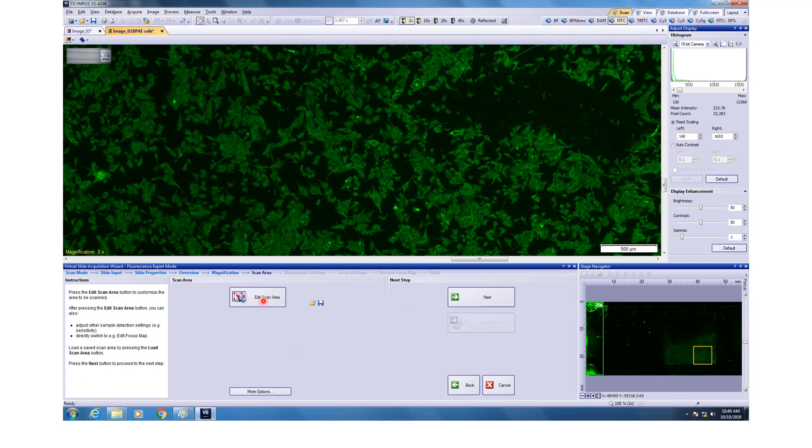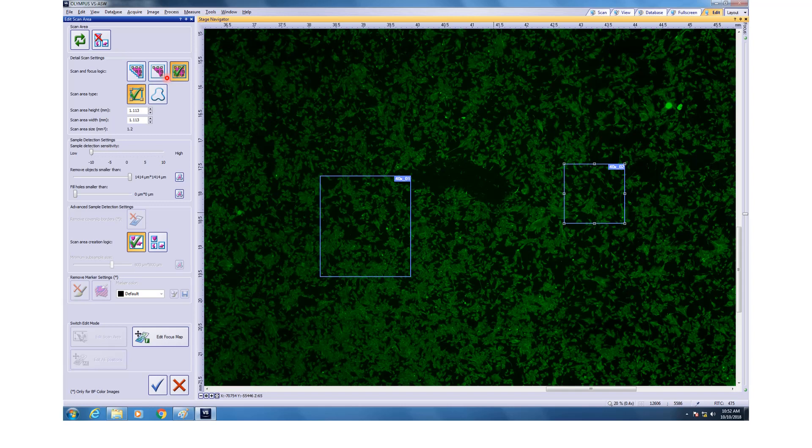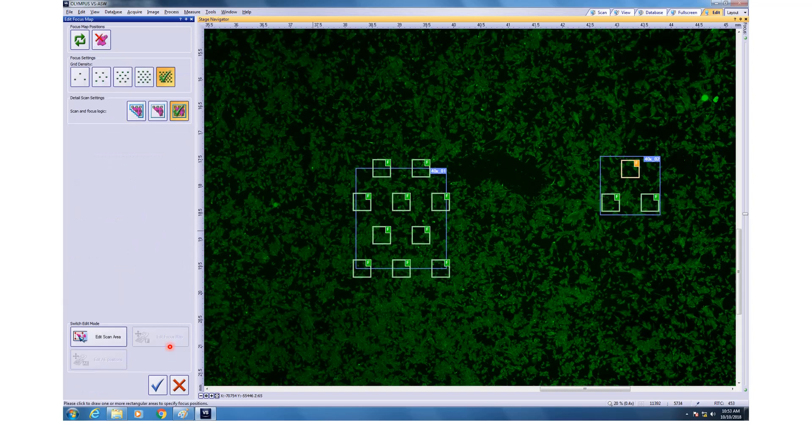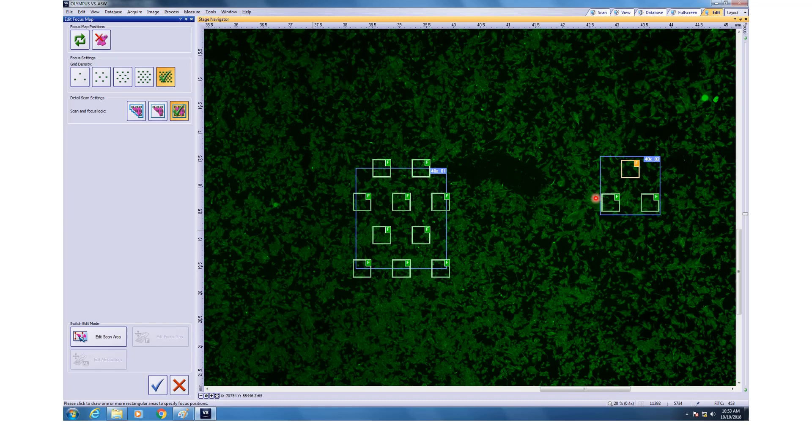After this, you can edit the scan area using this button just like we did for the bright field. You can draw boxes, you can do area selection and things like that. For this one, I would go for just brute force method because that's not a very big area. Edit focus map. I have added enough focus points and I can see that there are roughly about 10 to 12 focal points. That's not a lot but that's good enough. I click this next option.